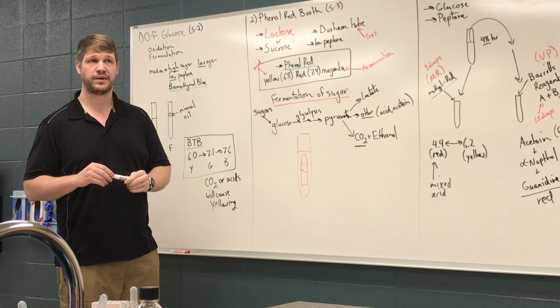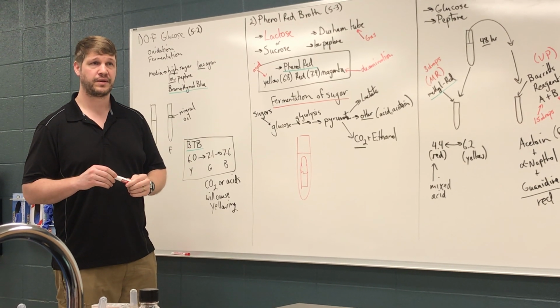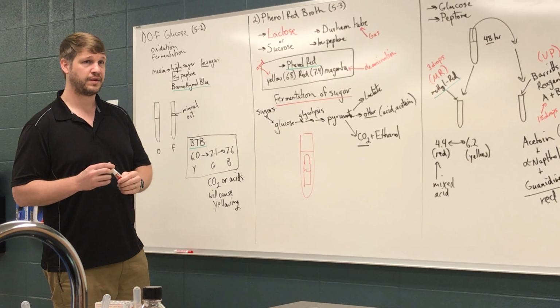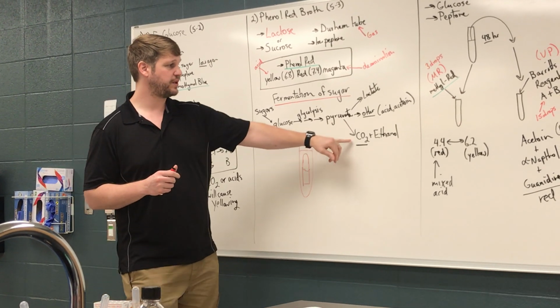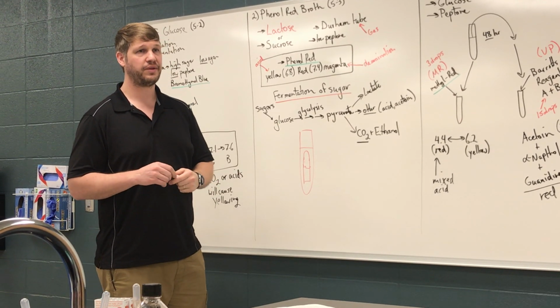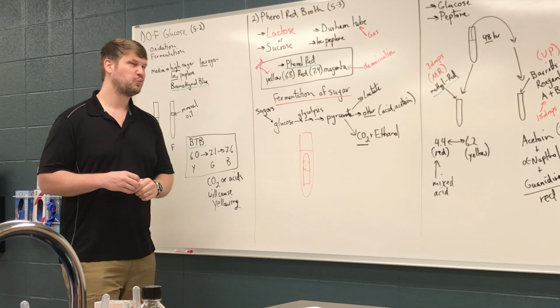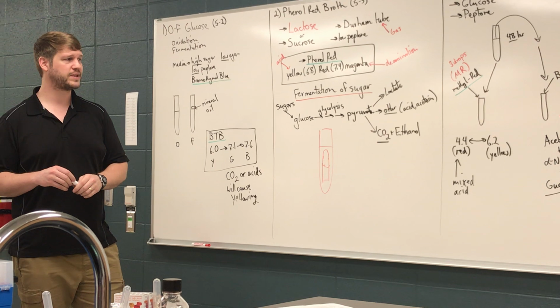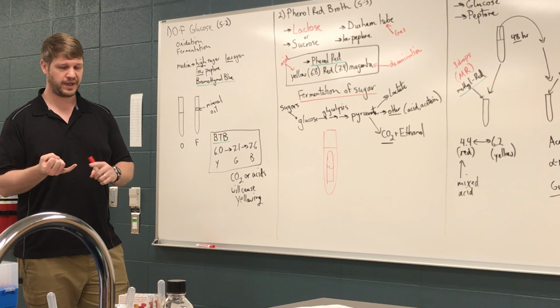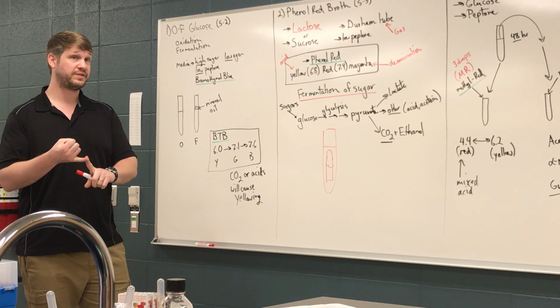So which is the gas that's indicated within that other tube? If you're getting gas in here, like 90% of the time you're going to get CO2. In theory, you could potentially produce some other gases, but most of the other gases that would be produced are either not produced in sufficient quantity.